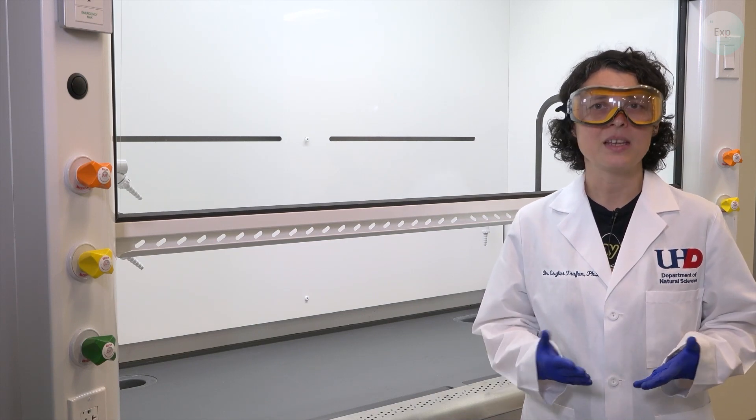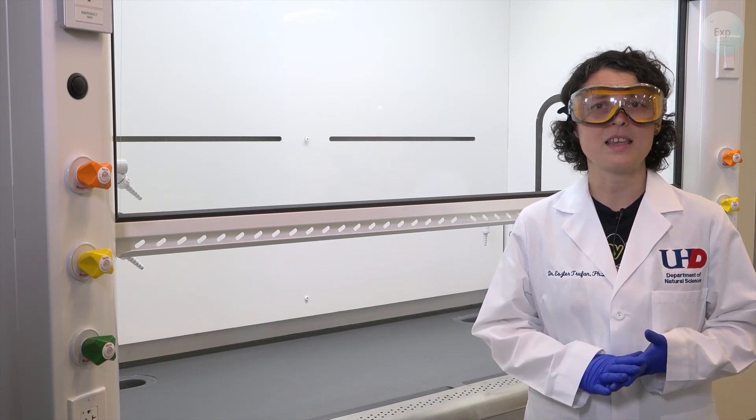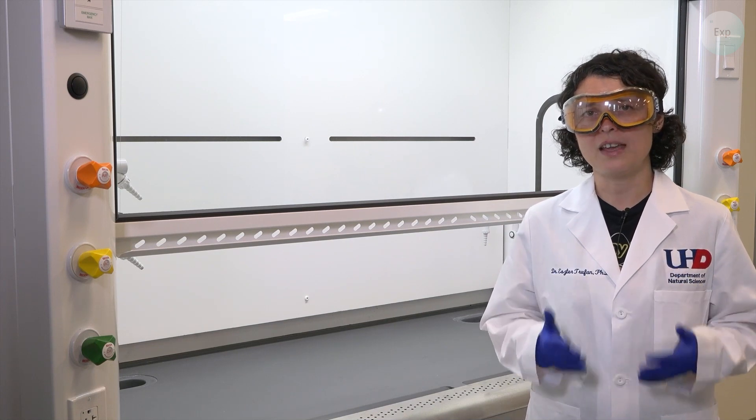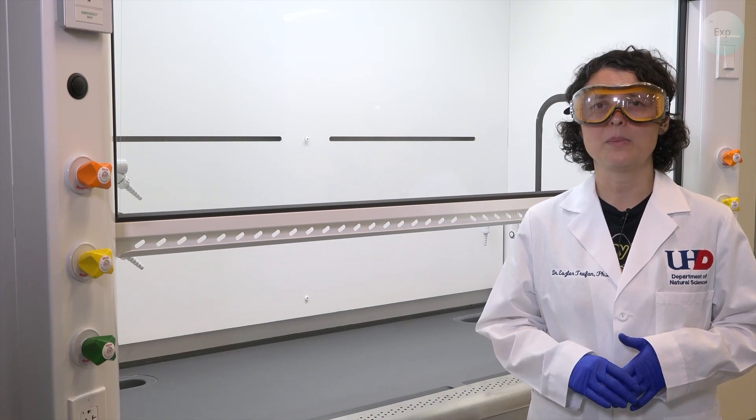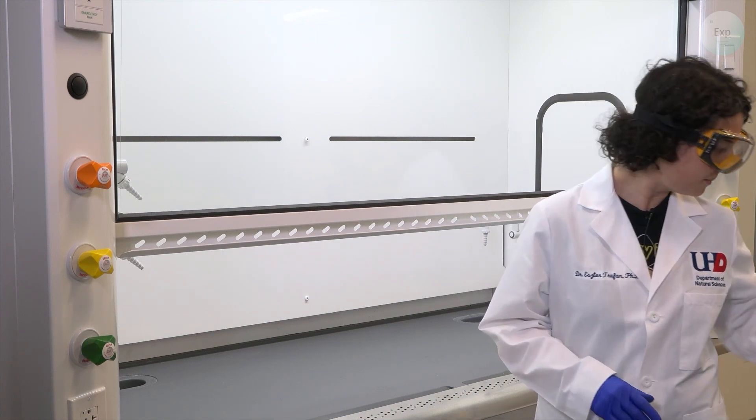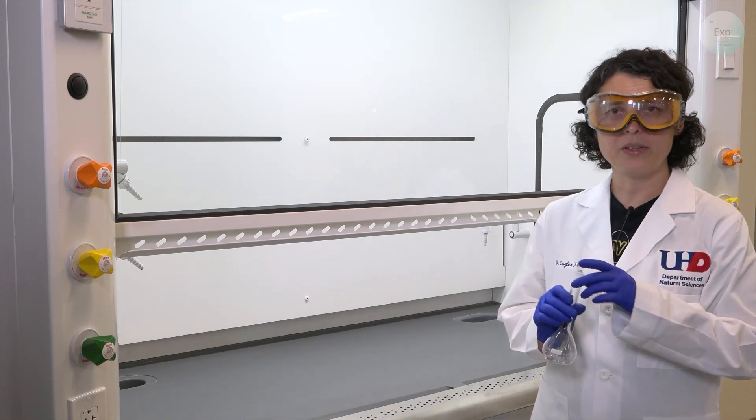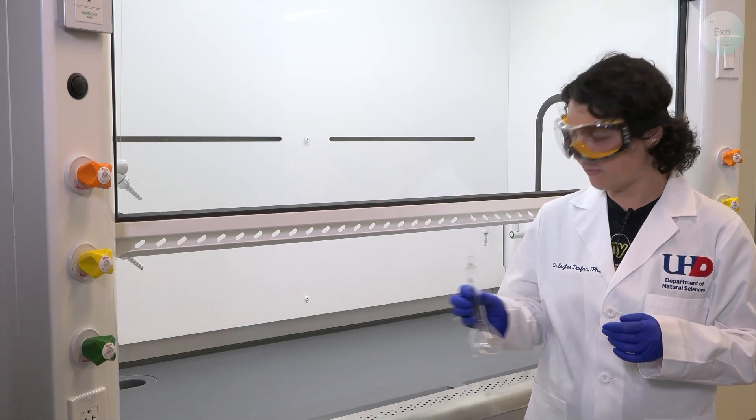So let's get started. The first thing that we're going to need is a volumetric flask because one should never make a solution in any other container than a volumetric flask. For today's experiment we're making 100 milliliters of solution, so we will need a 100 milliliter volumetric flask.